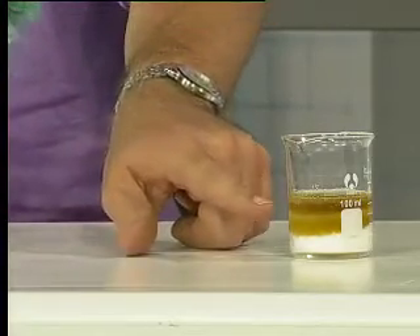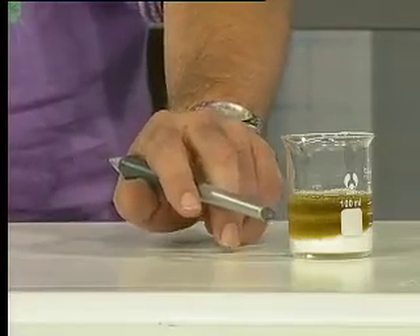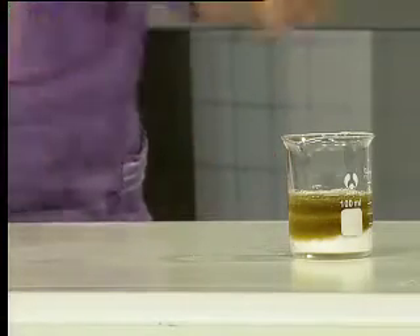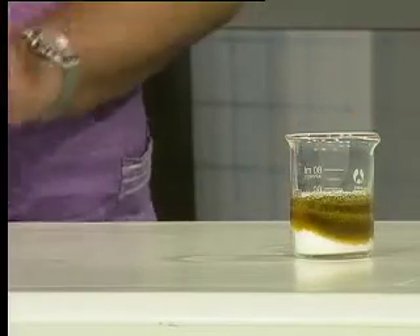Notice how it's seeping through the sugar and it's going this yellowy-brown color, and very slowly, if we turn it around, you'll see that it's getting darker and darker.